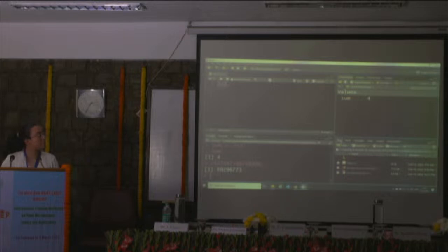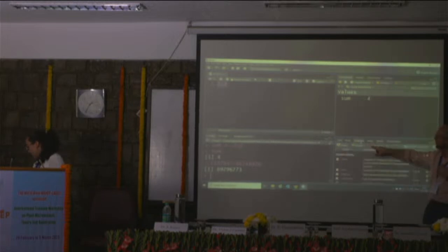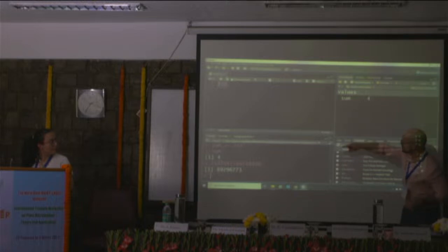Think of R as a program that contains many programs. So every time that you go to your laptop and then you want to do a phylogenetic tree, for example, you open the program that you have to do the phylogenetic tree. So in RStudio, it's the same. This is kind of the administrator of all the programs that you have, and then you go to packages. And then here you have all the programs that you need for your research. Yeah? And then you basically click here, and then it says somewhere that the package is loaded.